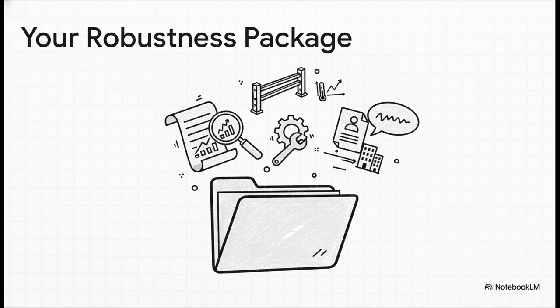So at the end of this whole process, what you have is a complete robustness package. This isn't just a protocol anymore. It's the protocol plus a guide to its sensitivities. It includes those clear guardrails, specific training notes for new team members, and crucial transfer notes that are going to prevent that transfer shock when the assay moves to a new lab.